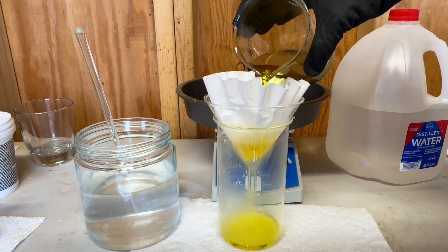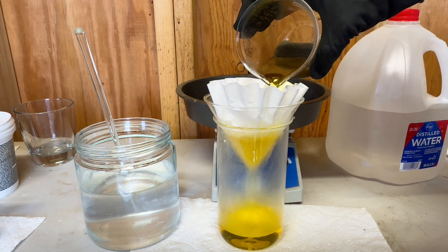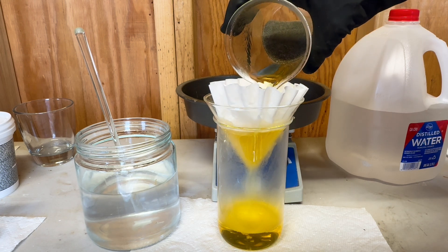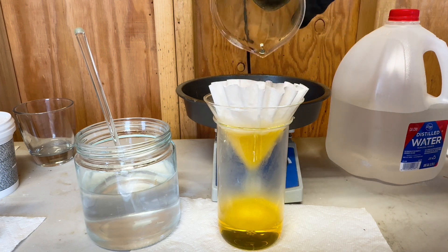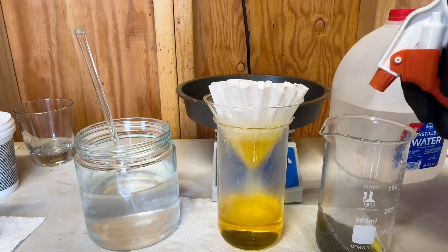I did allow this aqua regia process to boil for one and a half hours. Now we are going to pour our aqua regia into our funnel to filter out all the sediments that's in our solution.